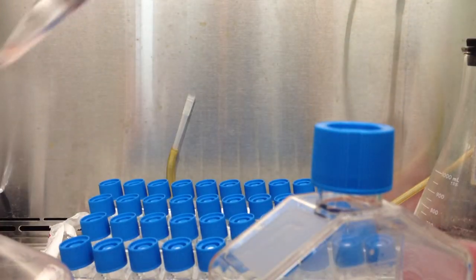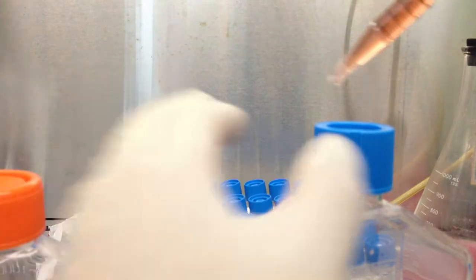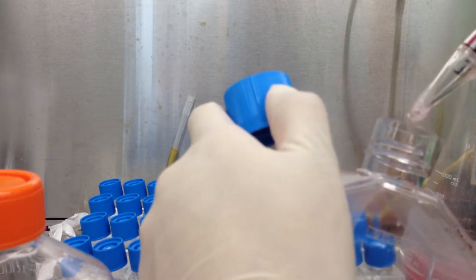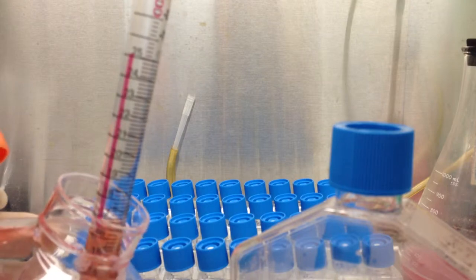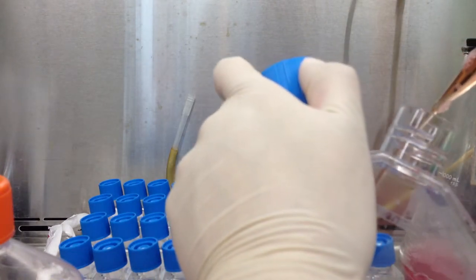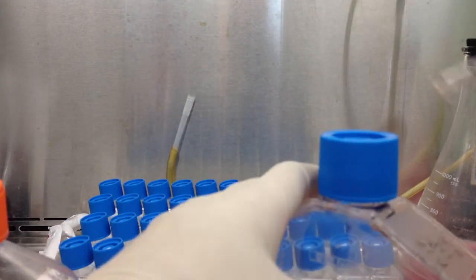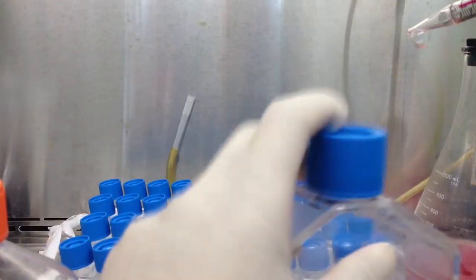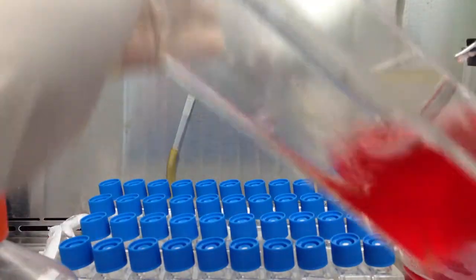This is 90. And keep putting the cap back on, just on top of the flask. It's 120. This should be 150. Just to check, I'm gonna put this to the side. Yep, 150. Okay. And then I'm dripping a little, but kinda do this to get all the cells off and make sure it's all deactivated.